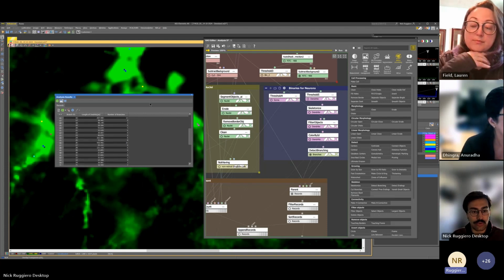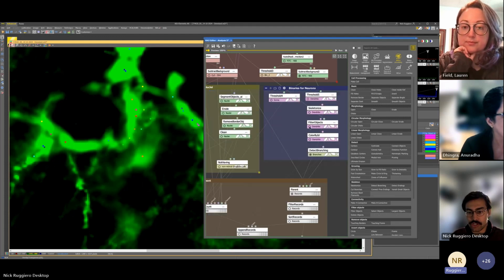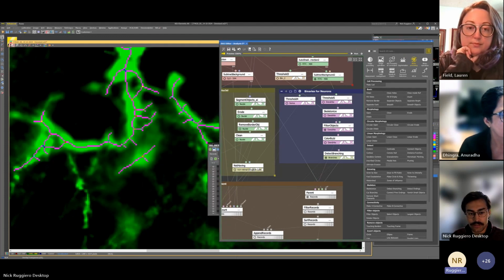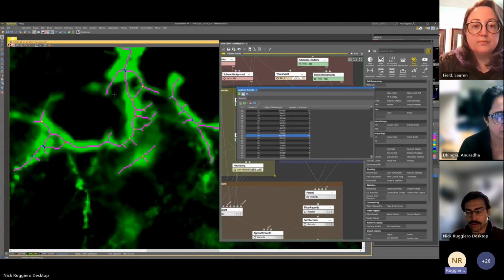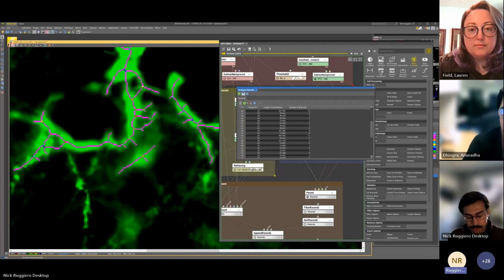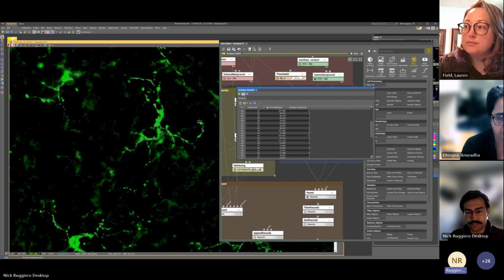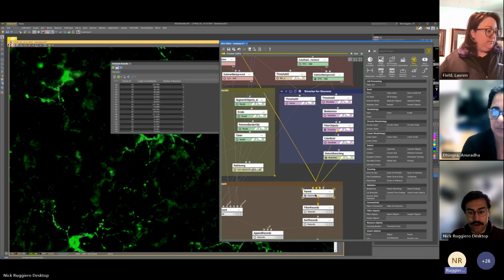This is a really neat tool, and something that can be useful when we're looking at this is if you're not sure exactly what you're looking at. Did I graph away? Yep, here it is. You can go in, if you double click on any of these, it will highlight which object that is. So this can be useful if you're trying to find objects within your image that you're not sure exactly what it's referencing. So that's sort of a super basic way of parent measurement.